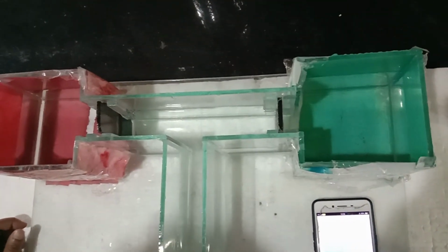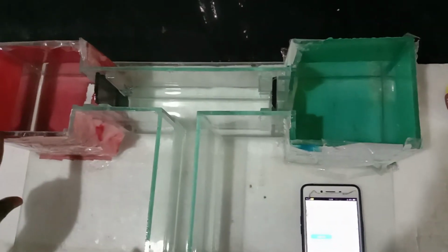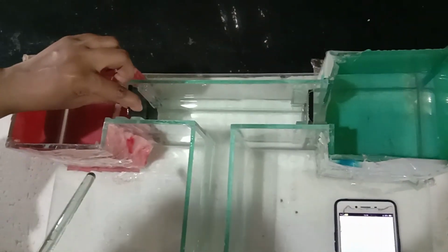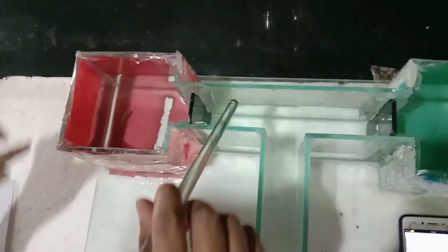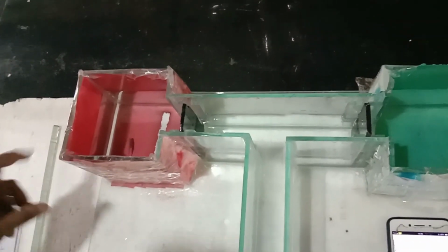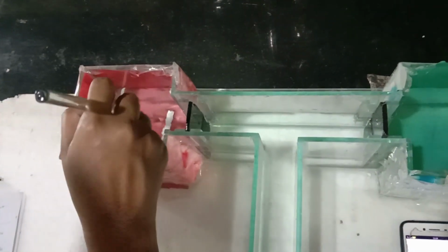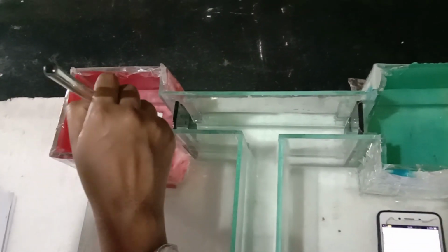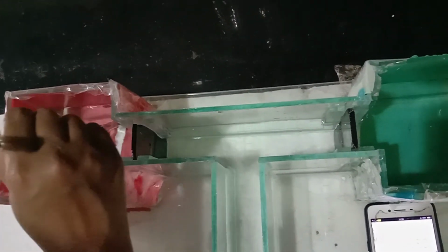Now after completion of 5 minutes, we open the gate leading to the unfavorable zone, which is a danger zone. So we allow the zebrafish to remain there in the danger zone for 5 minutes. In this zone, we disturb the zebrafish with the help of a glass rod or we chase the zebrafish with manual chasing. So in this way we disturb the zebrafish for 5 minutes.